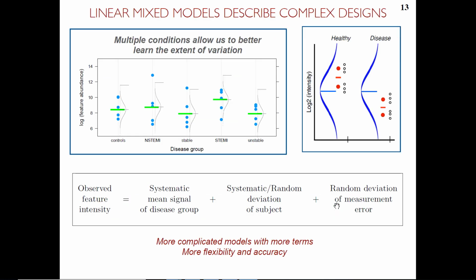We can do other things. So, for example, what if we want to include biological and technical replicates? So sometimes we have multiple replicate mass spectrometry runs, or multiple enrichment steps, or multiple extraction steps for the same biological sample. So this is my old example. This is a new example. So this is one group. I have 2 replicates from this group, biological replicates, and now the black dots, these are technical replicates from the same biological replicate.